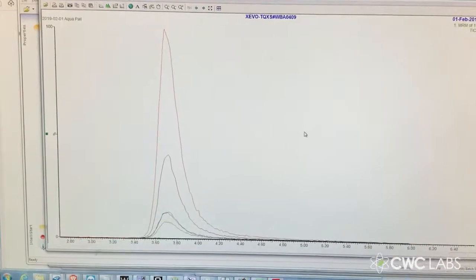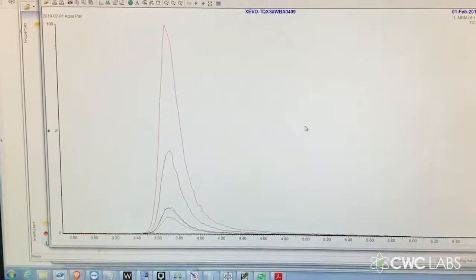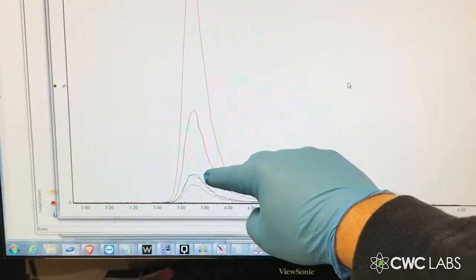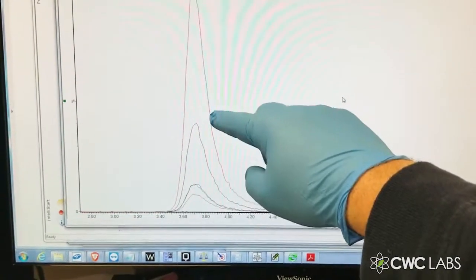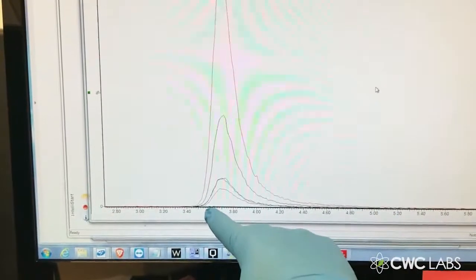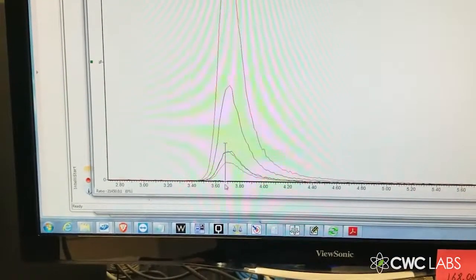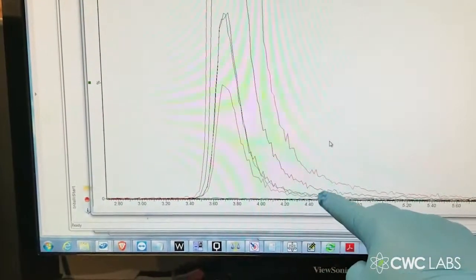Finally, here are the results for the large filters, and by the way, I'm going to walk you through all these shortly to show you exactly which filters did what. But this is the original 2 ppm glyphosate, and then these are the results of the large filters, the gravity filters, showing that even the worst one performed, not bad. It's kind of mid-range, but several of them performed very well, and there are 2 down here that performed extraordinarily well. You can't even really see them unless I zoom in. See, there's a zoom in, and you see there a couple of lines right down there, baseline.